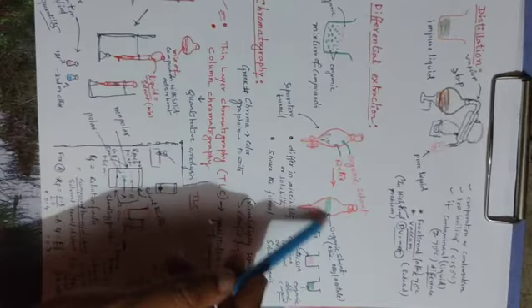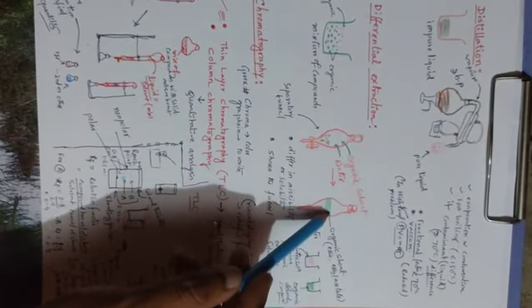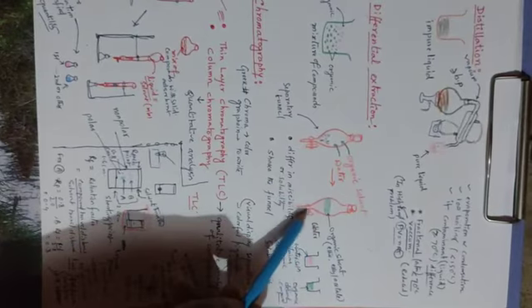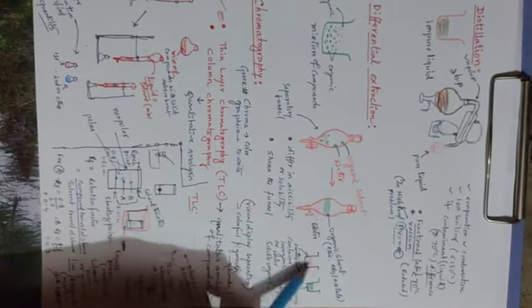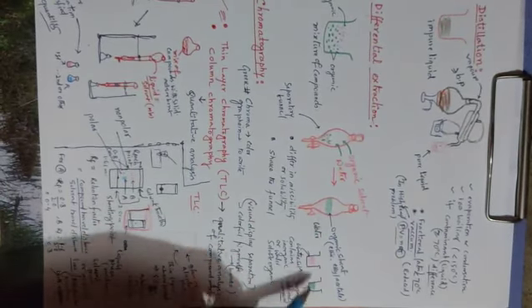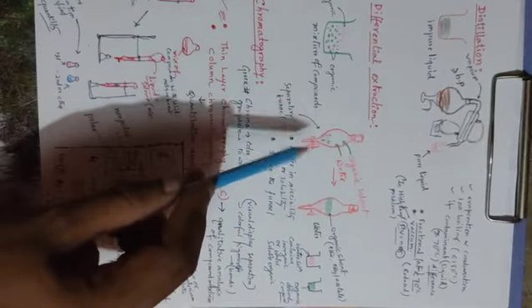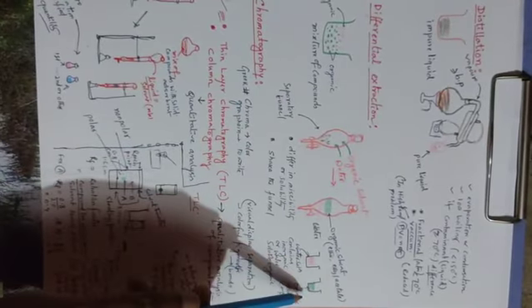In most cases, an organic solvent like ethyl acetate will be on the upside and water on the downside. We just rotate the knob and collect these two layers separately. In this way, using the differential extraction method, we can separate our compound.